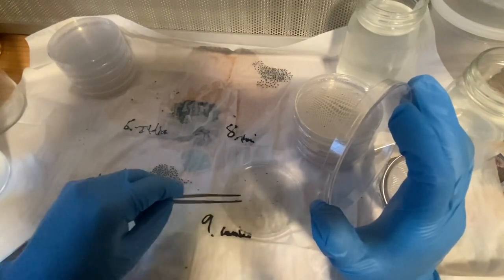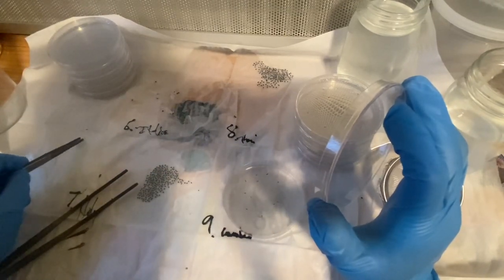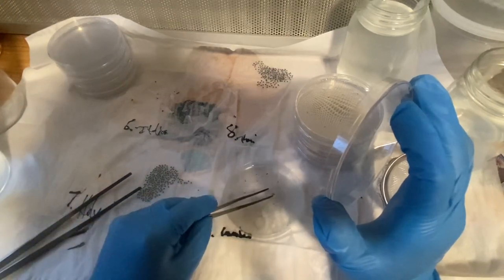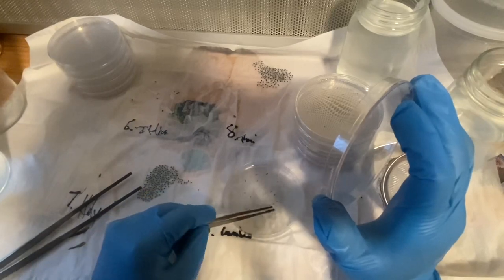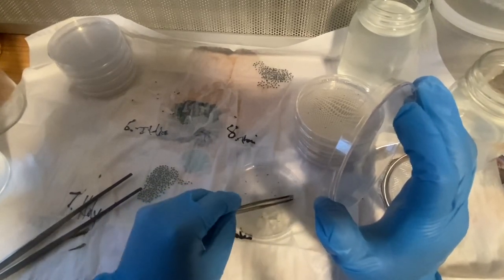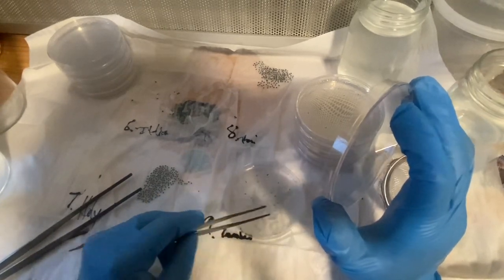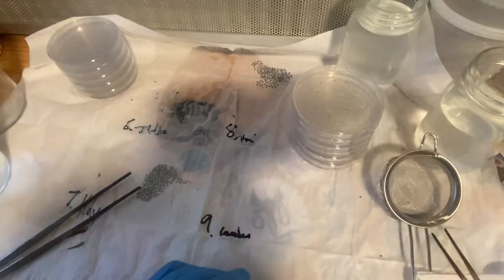So I like to always kind of score my plates so that they kind of get stuck in the grooves. And remember, any seed could grow. That's the whole point of tissue culture. If there's an embryo there, it should be able to germinate on this media and grow just fine. Perfect. All right, let me show you what I do now.